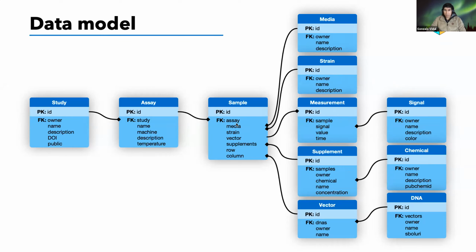on a sample or well with a media, with a determinate supplement or chemical, which can be a chemical like IPTG. The whole 96 well plate with samples will be an assay, and a set of assays may be a study.